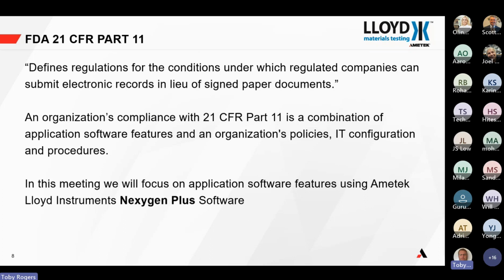So traditionally, a legal document and data integrity was achieved by taking a pen and signing printed reports and then storing those reports for the retention period, which could be many, many years in the pharmaceutical medical device world. Obviously, everybody wants to move to an electronic alternative, and 21 CFR Part 11 gives those conditions and regulations where you can move to electronic documents and records.